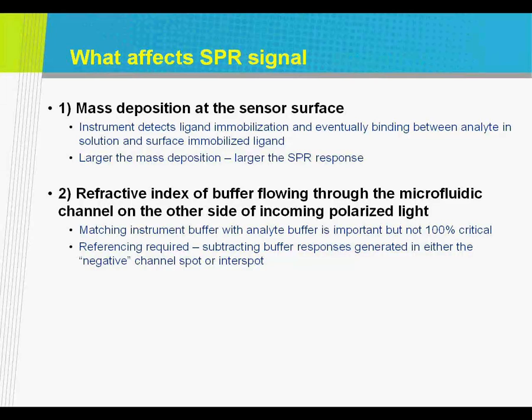So here in this picture, you've got a flow channel that supplies the ligand or an analyte, being the two proteins or something like that, and you can monitor that interaction by shifting this signal.